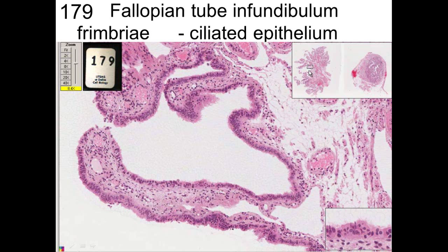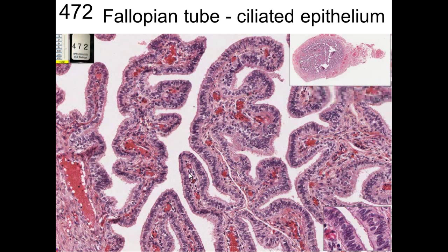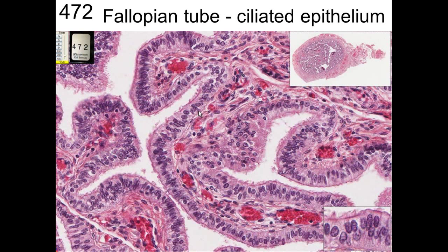So in the fimbria, you have these projections that coax the egg into the oviduct, and in the oviduct itself, it's got all these cavities that are brought about by these little projections. You can see ciliated cells on not every cell, but a lot of the cells, and that's involved in moving the fluid to move the eggs down through the oviduct. And also this provides the environment for fertilization, which occurs in the oviduct. You can see the nice ciliated cells in through there.